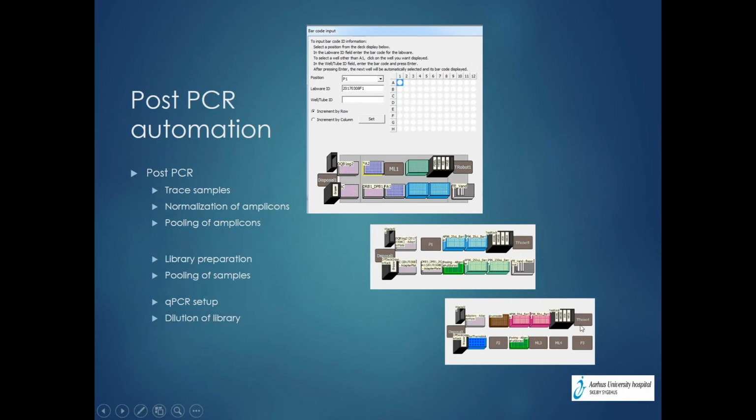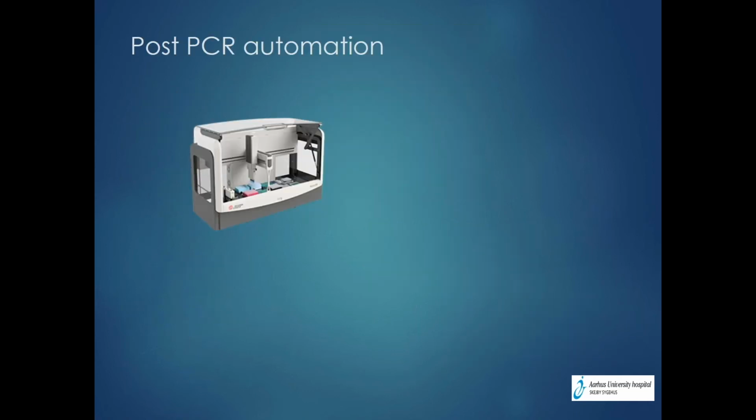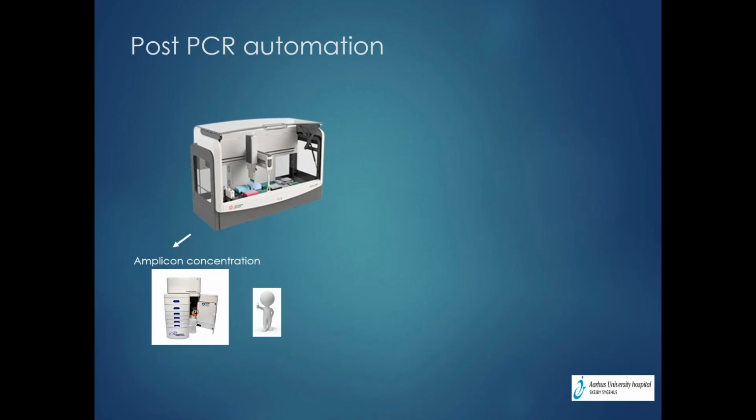One thing I haven't touched much upon is the thing that's situated here, which is the T-Robot, the onboard thermocycler. With this thermocycler, we don't need seals to be put on the plates. We put a pad on the lid of the T-Robot, and we replace this each time. It could be clean, but we place it each time, so we can set up this procedure in the afternoon, and it can run during the night, and we don't have to come and look at it.